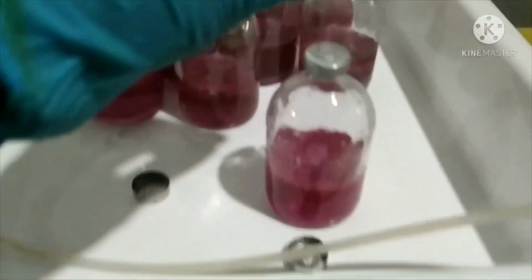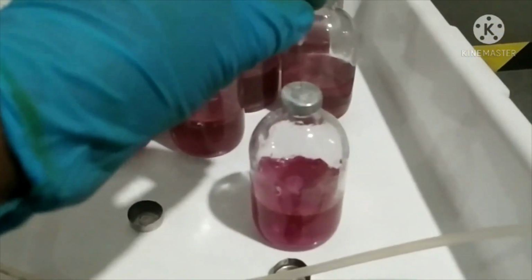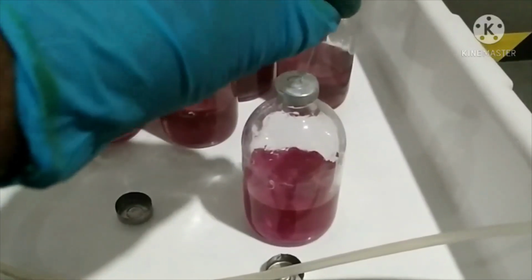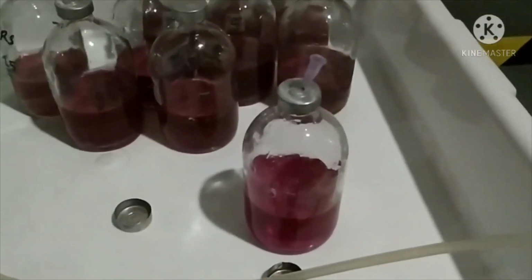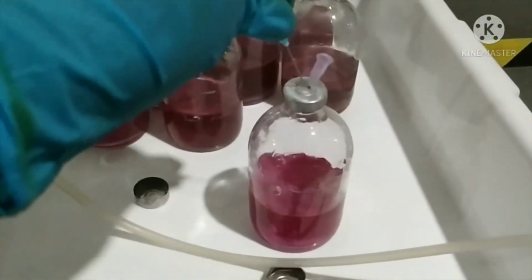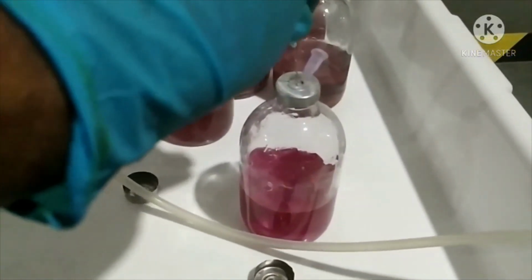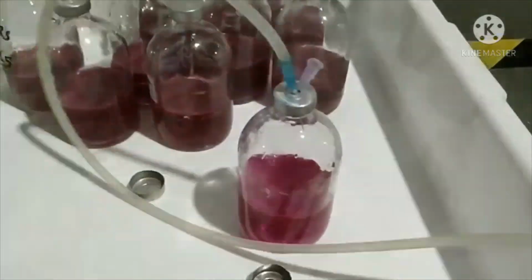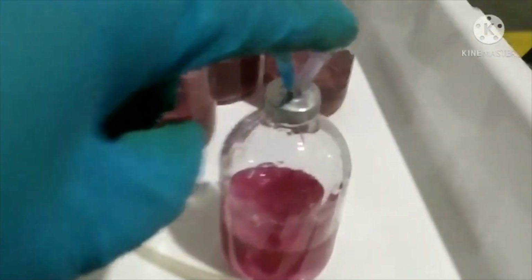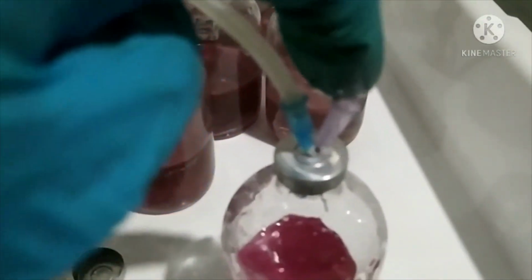One line is CO2 out and one is CO2 in now. We will check whether the CO2 is coming out or not. You can see there is a bubble.